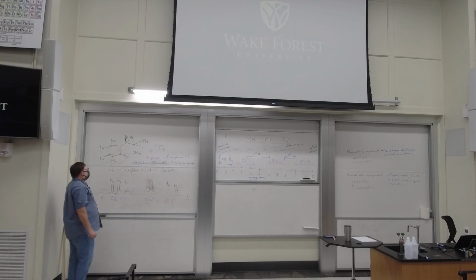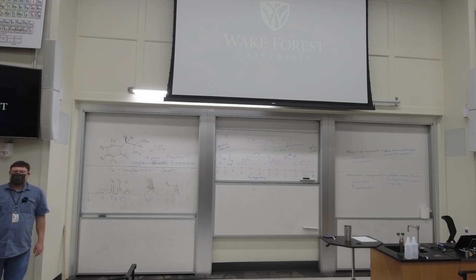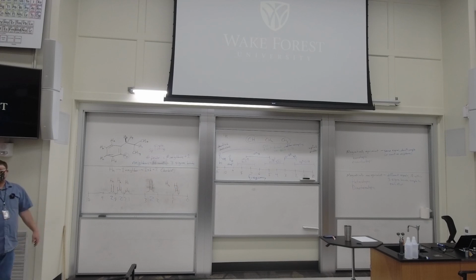All right, HH. How many neighbors does HH have? Hang on, before anybody answers, what do you think? All right, we got 2. 2 and 8 are different. Finally, some disagreement. Anybody want to say something other than 2 and 8? 3. Not a bad answer. I can see how we get to 2, 3, and 8. Anybody got another number? I think it'd be hard to come up with a different number.